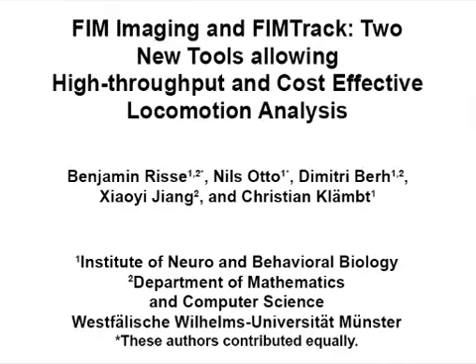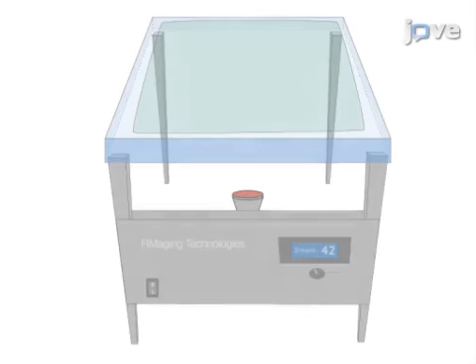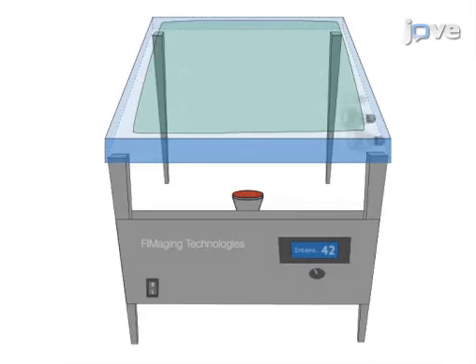The overall goal of the following methodology is to visualize and quantify the locomotion of Drosophila melanogaster larvae, allowing high-throughput screening in free-moving conditions. This is achieved by creating a tracking surface on the FIM setup and using frustrated total internal reflection for indirect illumination.